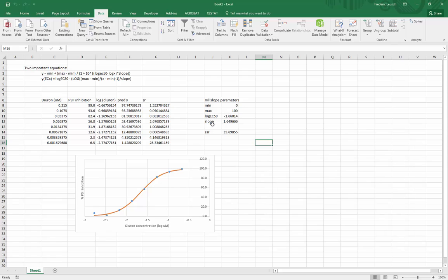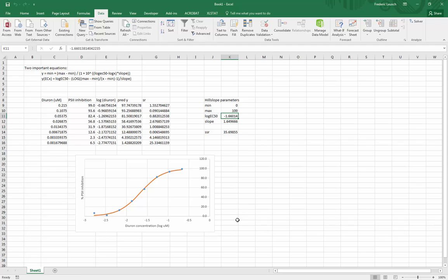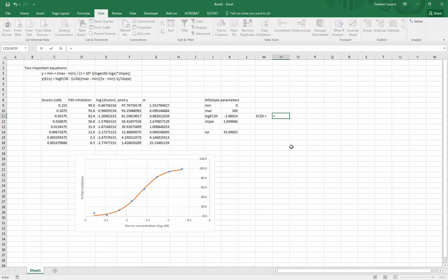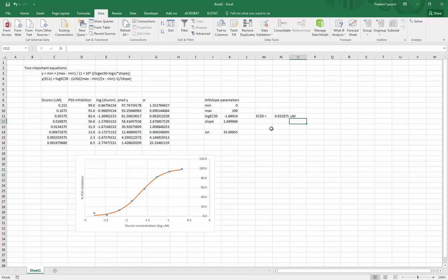So what is my EC50? Now here it is, it's actually one of the parameters of my Hill slope equation. It's minus 1.66. Now remember this is a log scale. Whenever you're expressing anything in your values you probably want to give the unlogged value, right? So to go from a log scale to the natural value, if it's on a base 10 you just write 10 to the power of this value here. And so here is the diuron EC50 in micromolar, 0.021.